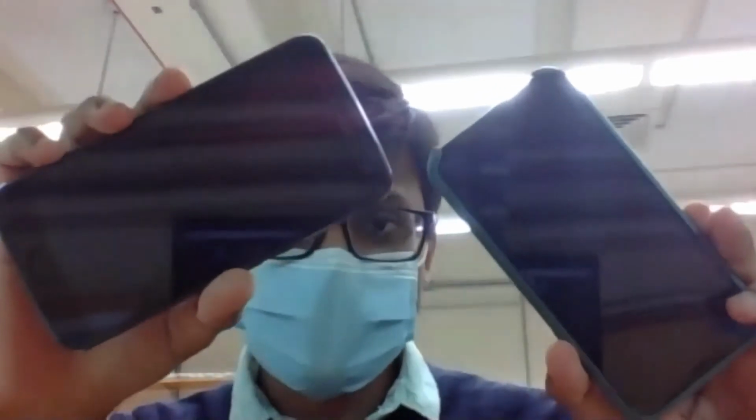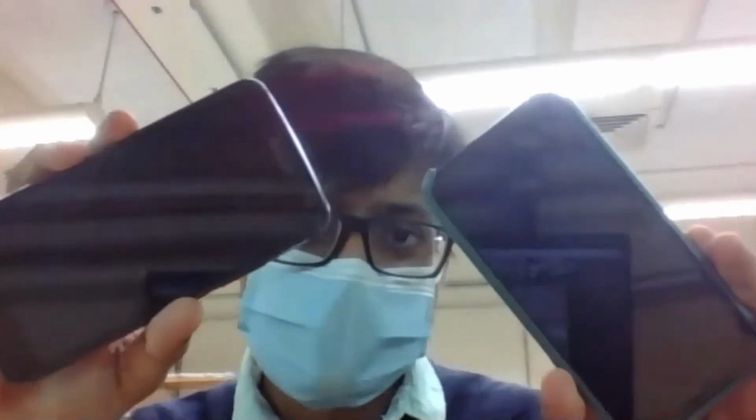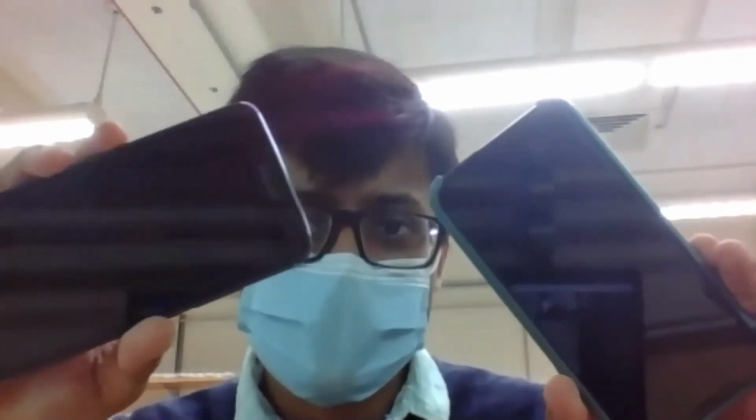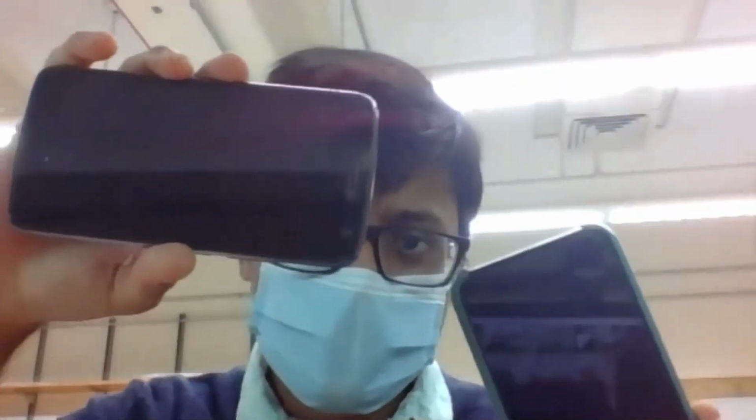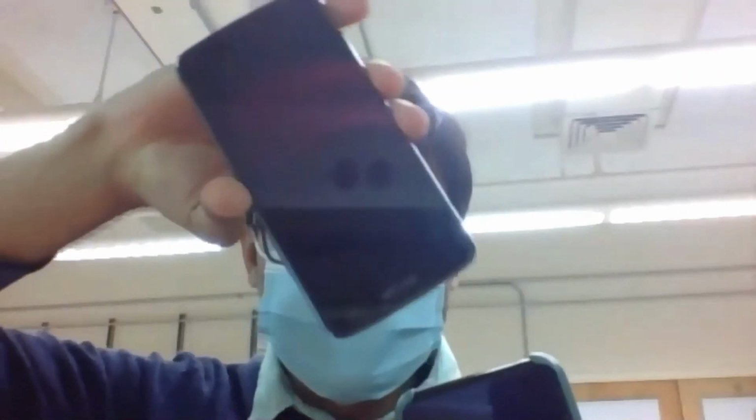But now suppose you did not, and you instead hit this other domain. Because they're so small, there is no way you know which domain you are hitting. Now you have to rotate the phi to make them in line, so make this one look like the one which was previously measured, and then do the experiment. So it's a combination of searching. How many different ways can you search? If that explains anything.